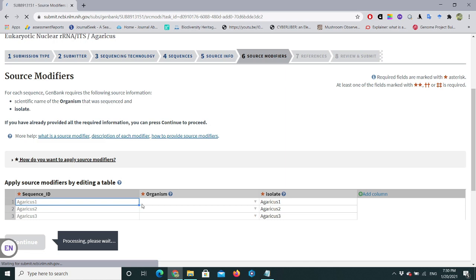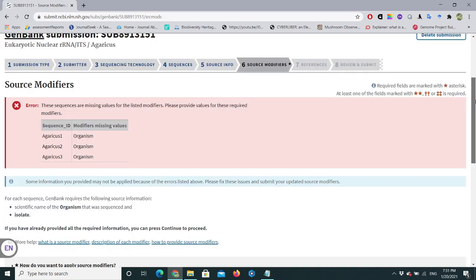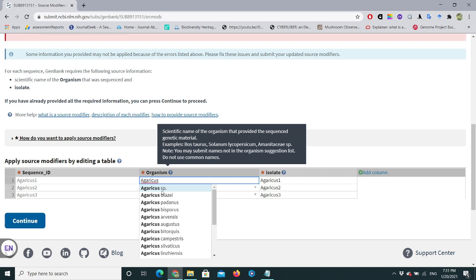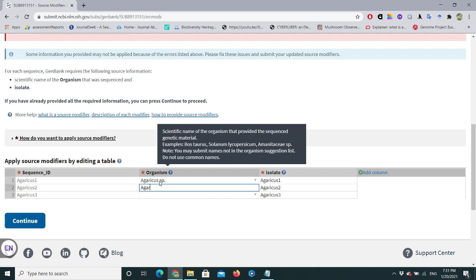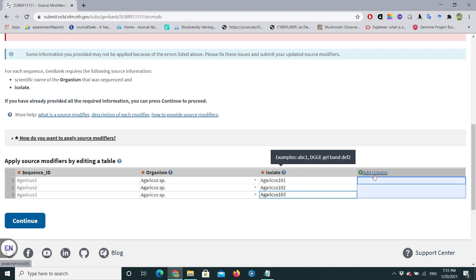In the editable table you can see your sequence IDs and three sequences. Enter the organism name — Agaricus species — for each. For the Isolate column, I'll enter agaricus1, agaricus2, agaricus3, or you can use codes like 101, 102, 103. If you want to add more modifiers, click 'Add Column' and you can select options like country, collected by, collection date, altitude, and so on.